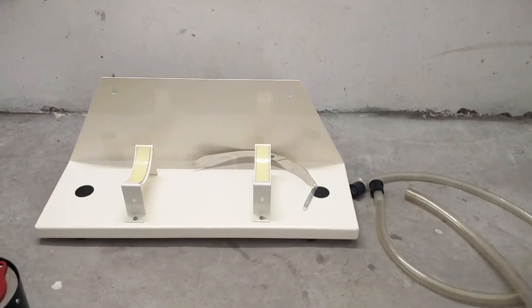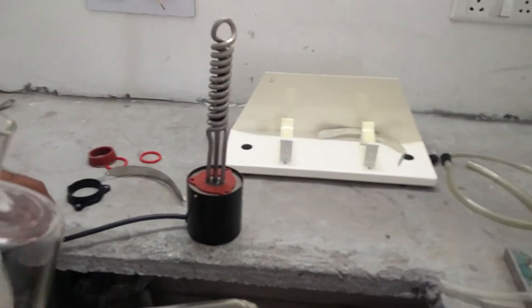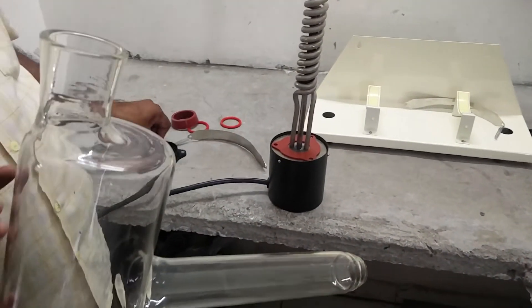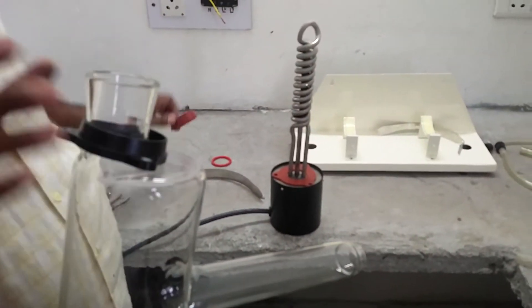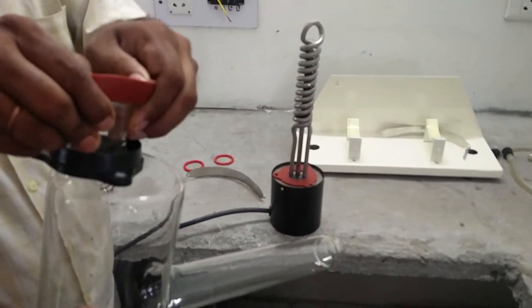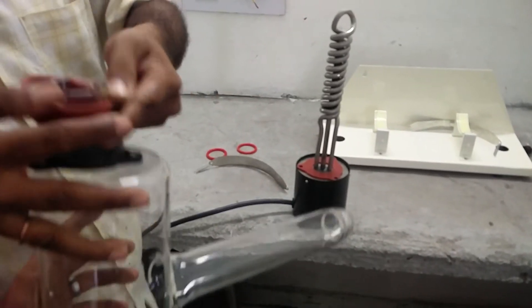Firstly, take the stand and keep it at a suitable location. Then take the heater and the borosilicate glass boiler. Put this flange on the boiler and this tapered ring. Tapered silicon ring on the boiler like this.